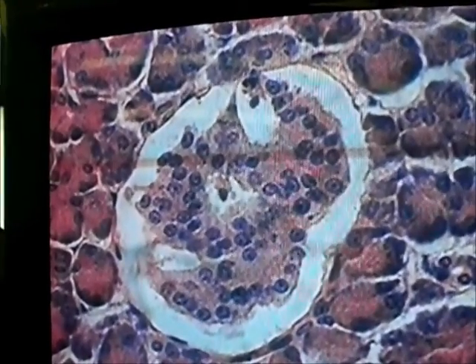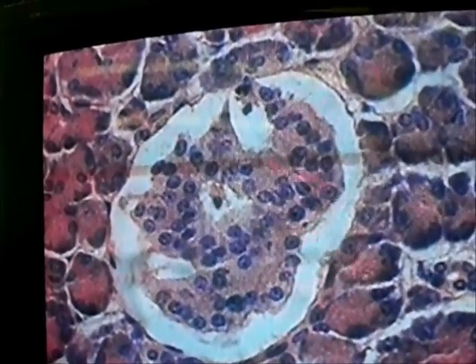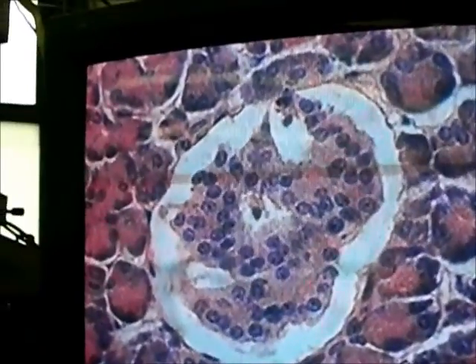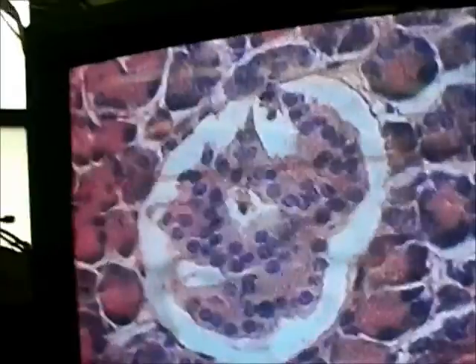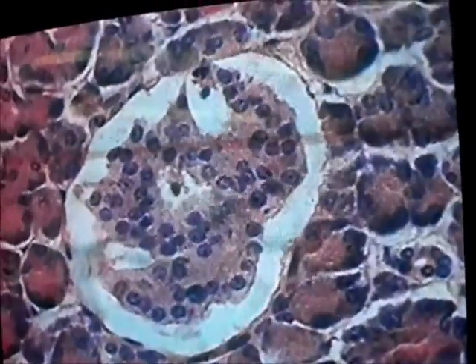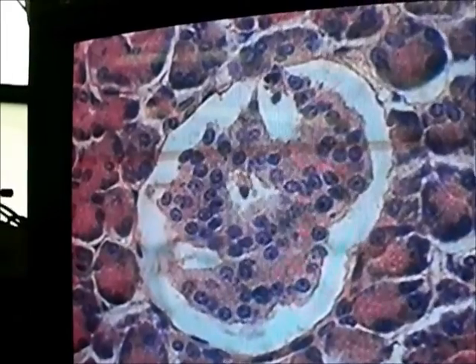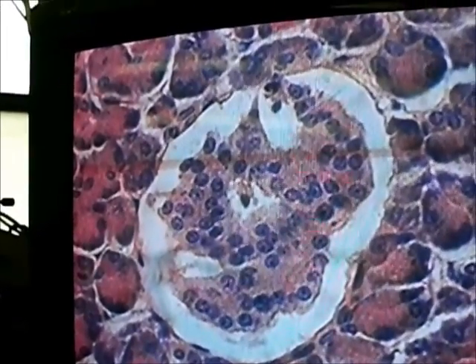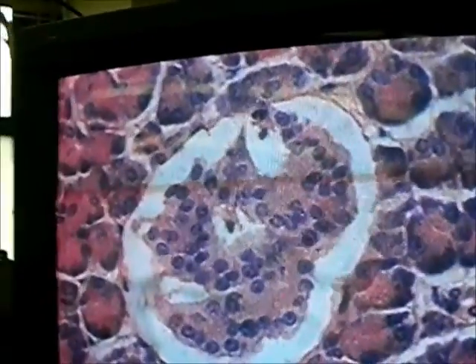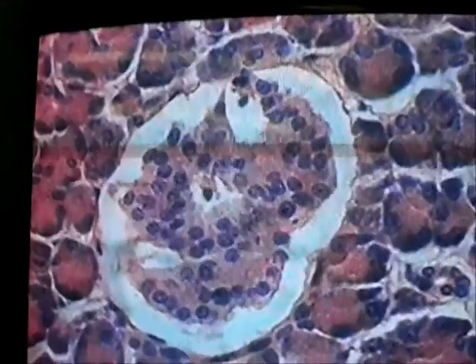What organ is that? Kidney. If you thought that was a dumb answer, why didn't you come out with the right one? I know it's not the kidney. Okay. All right, so that's the pancreas, right? Yeah, I get them confused all the time. But here's the thing, we know we're looking at the pancreas. Okay, never mind.